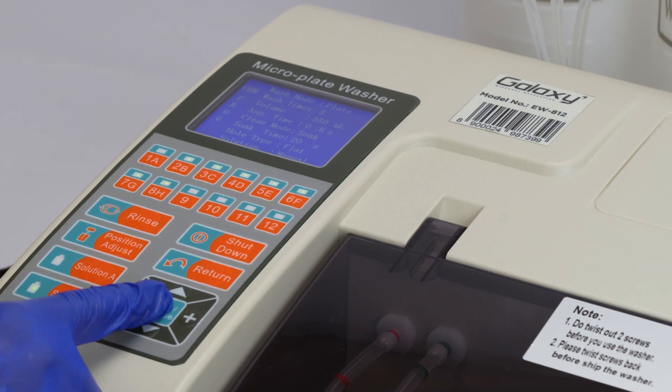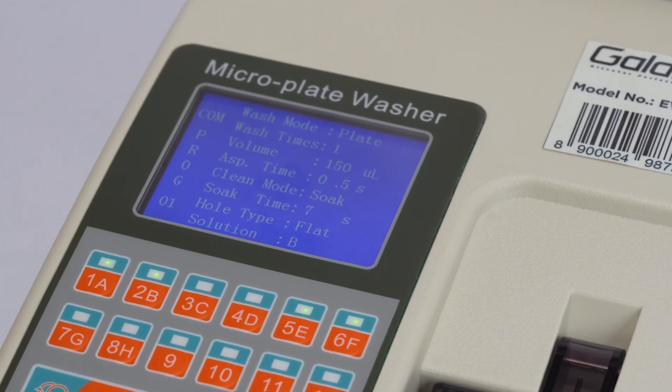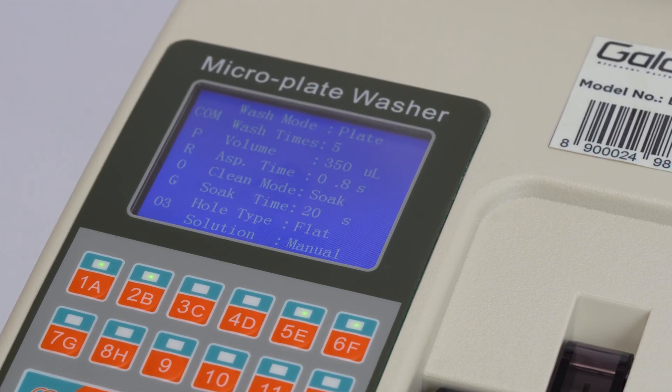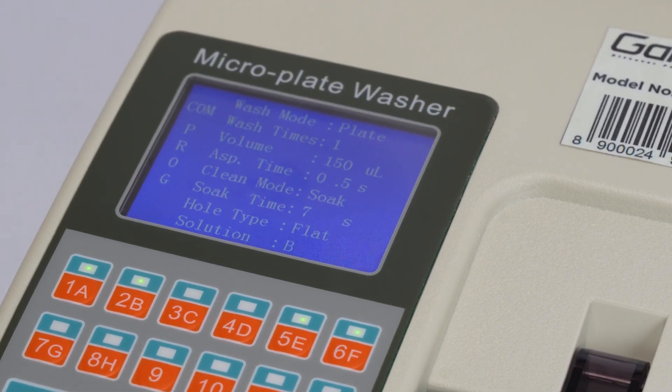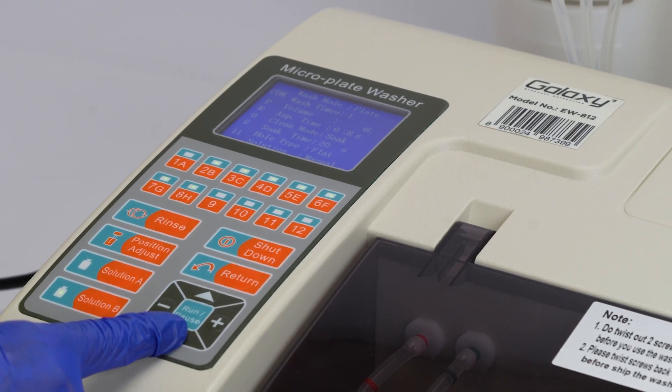To set the program, press the plus or minus key to choose the program number. You can save up to 99 custom programs. Use the up or down keys to adjust the parameters.